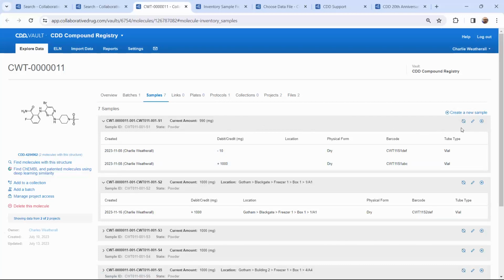As for the events and samples, we also have some key buttons to deplete that sample. It is no longer available. You have used it all. You can't do anything else with it, really. You can edit the existing sample information, or create a new event, which would add a new row here.